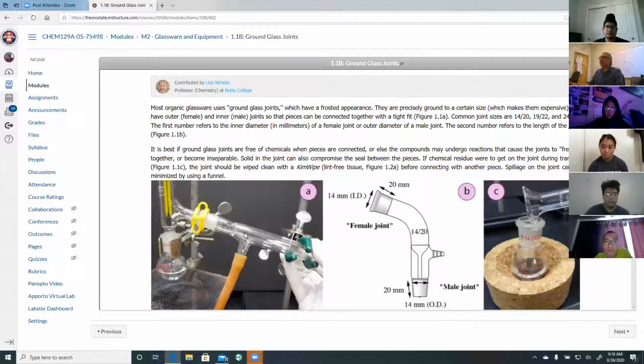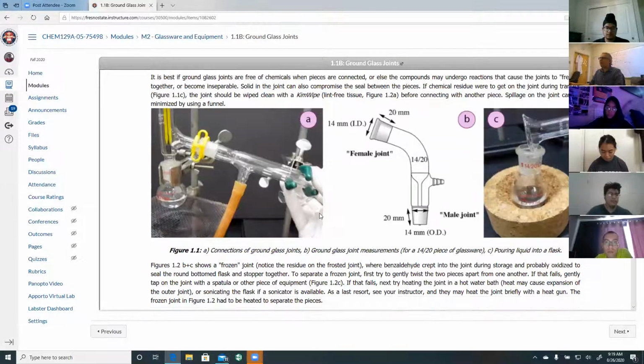Okay. The next equipment is the cylinder with two chambers and two little connectors to connect Tygon tubing. This is called a condenser. So when you pass water through the outer jacket right here, this upper connector is for water to come out, and we cannot see the other end. The other end has the water in.